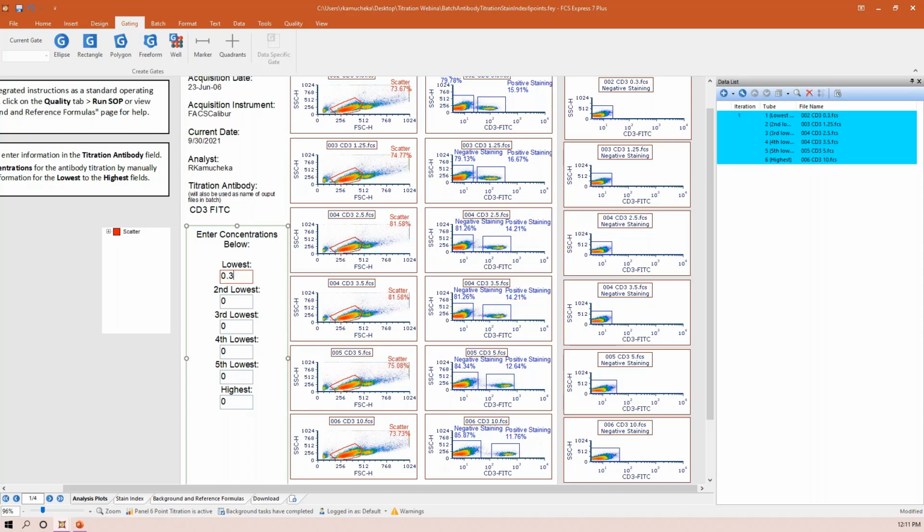So I'm going to do the 0.3, 1.25, 2.5. There we go.